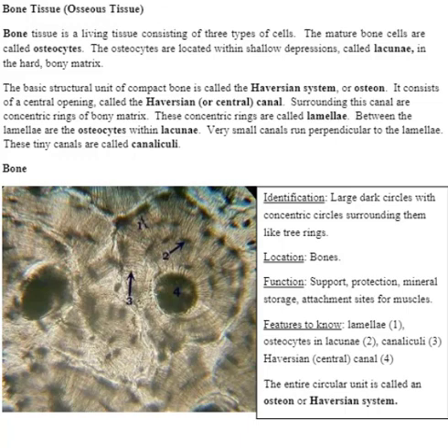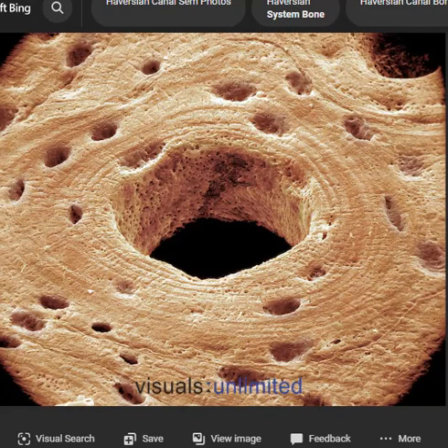And the last connective tissue that we're going to talk about is your bone tissue. And oh my goodness, look, we have lacuna. Man, we've seen those before, but you know, this time the lacuna have a different kind of cell inside because I'm not laying down cartilage, I'm laying down bone. So I have osteocytes living in my lacuna.